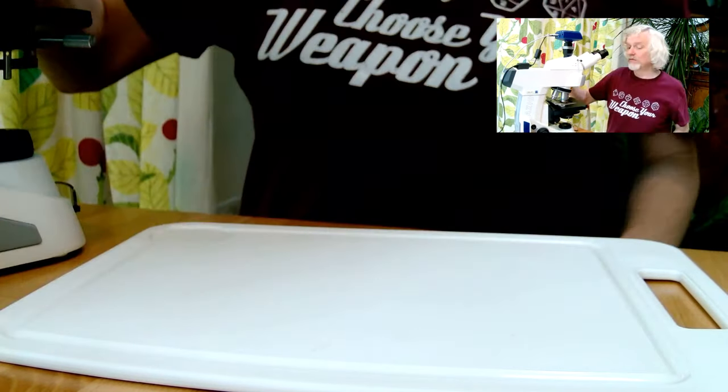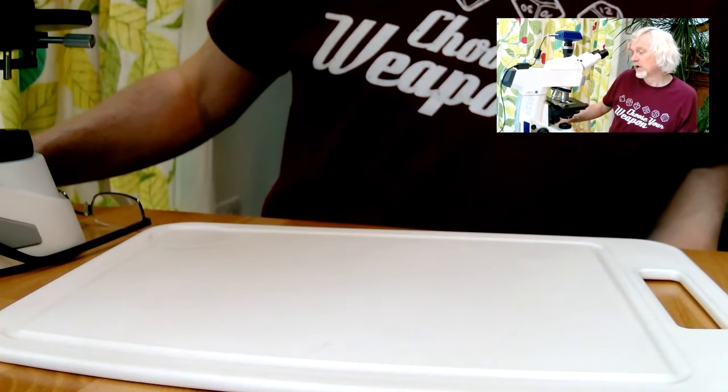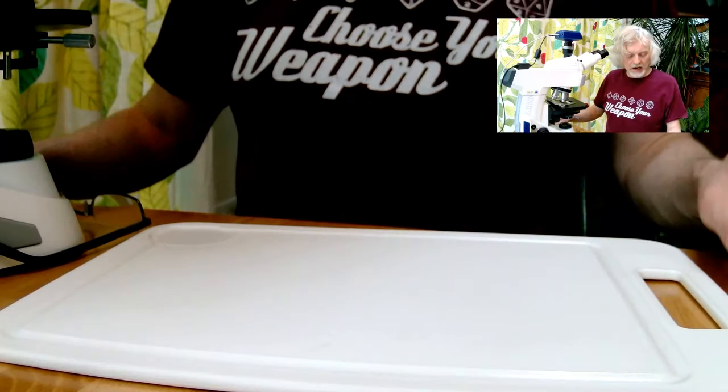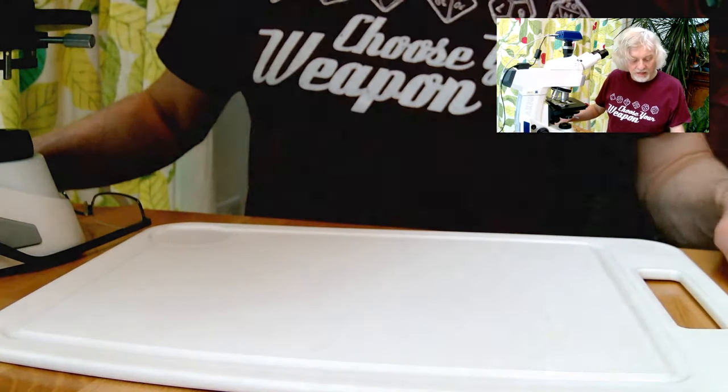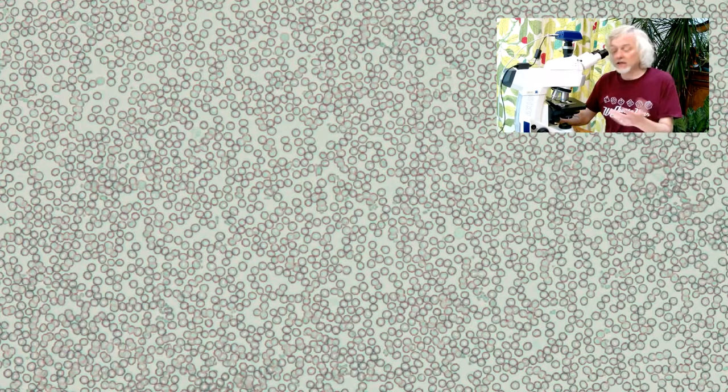So what I'm going to do is flip over and show you. There we go, it's doing its thing. And now if I turn that off, ta-da! There we go. Blood cells, and I've cured the flicker. So those are blood cells, not very interesting. So what we need to do is stain them up.